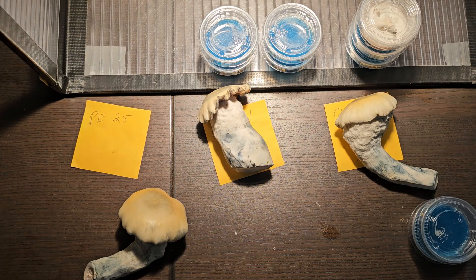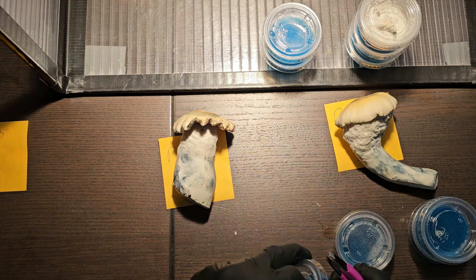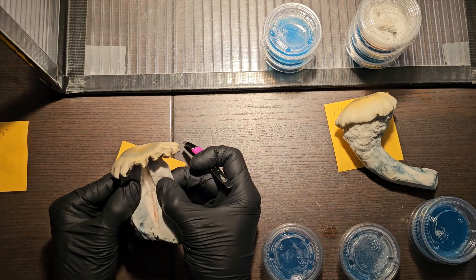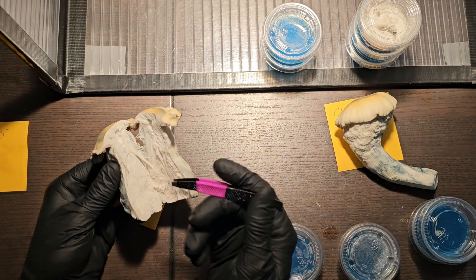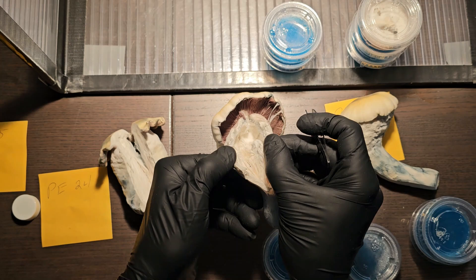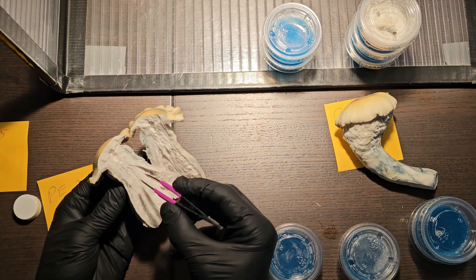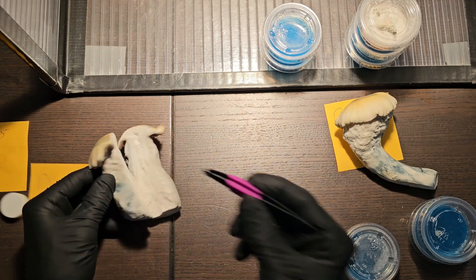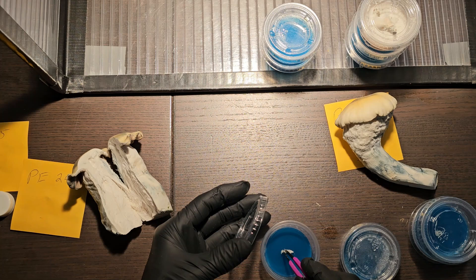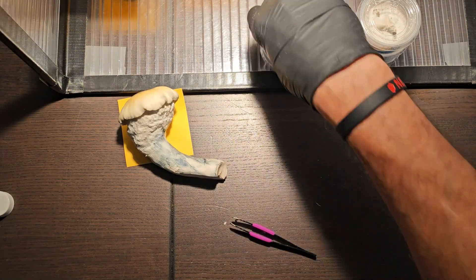Now we're going to do PE 26 — same idea, going to break into the middle of this one. This one is solid. Sometimes this happens — you can see the other one was hollow inside, whereas this one is just solid straight through. That's why I picked a few different styles: one was taller, one was thicker.